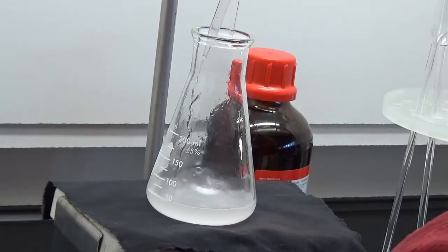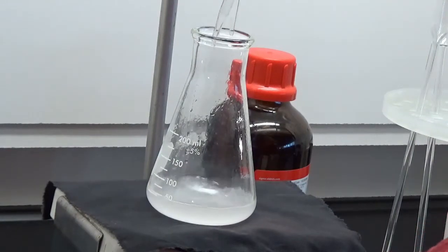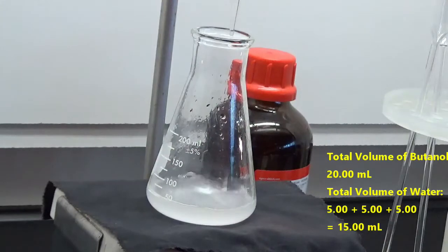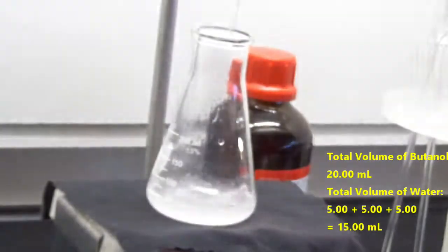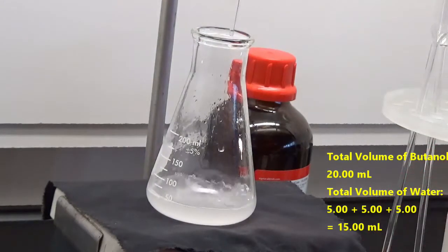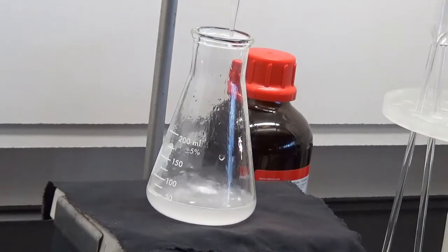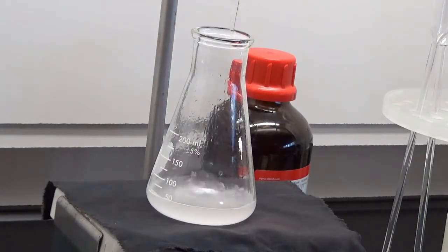You know, I like this experiment more than I thought I was going to like it. It's really cool to see. Cloudy. All right. And in the dark, cloudy. All right, so now 3.90 is my initial volume. And I'm recording this all on a data sheet, which I'd show you, except the camera's in a very precarious position. I like where it is, so I'm just gonna leave it right there.